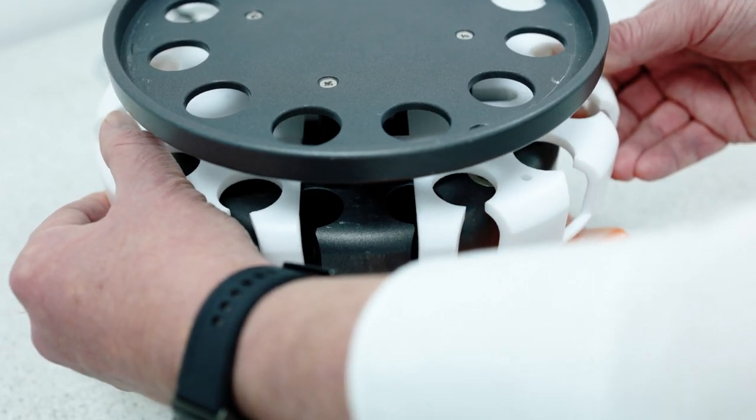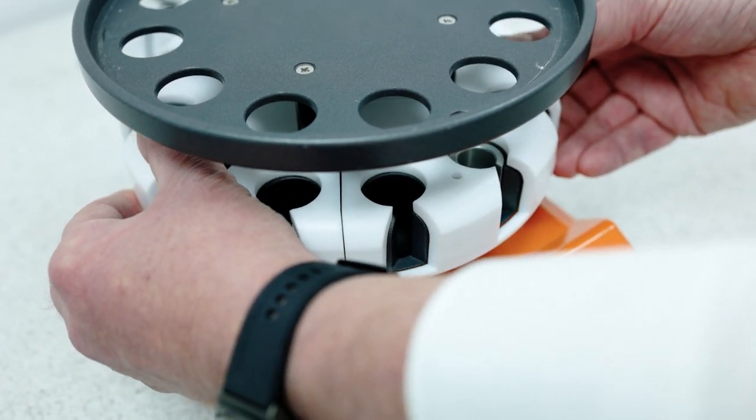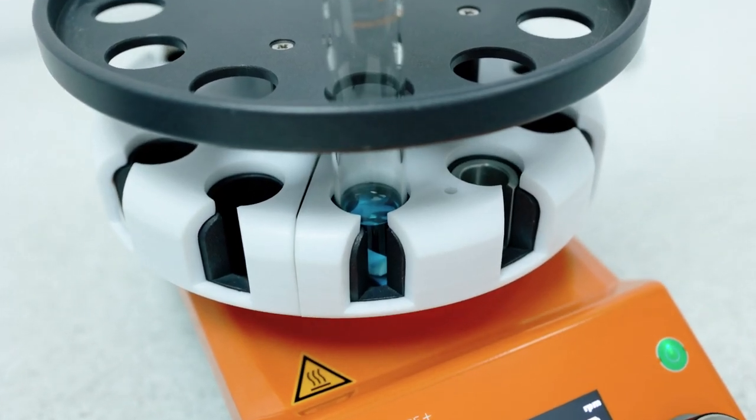It has a fluoropolymer coating to give excellent chemical resistance and make it easy to clean. With the addition of the two-piece Teflon insulating cover, we can gain energy savings of up to 36% while still maintaining excellent view of the samples.